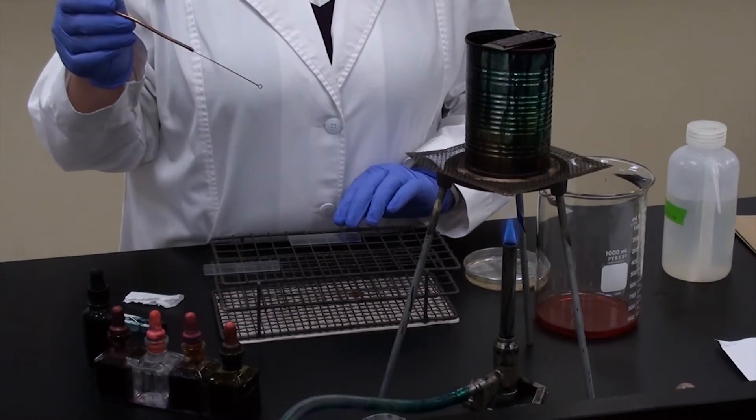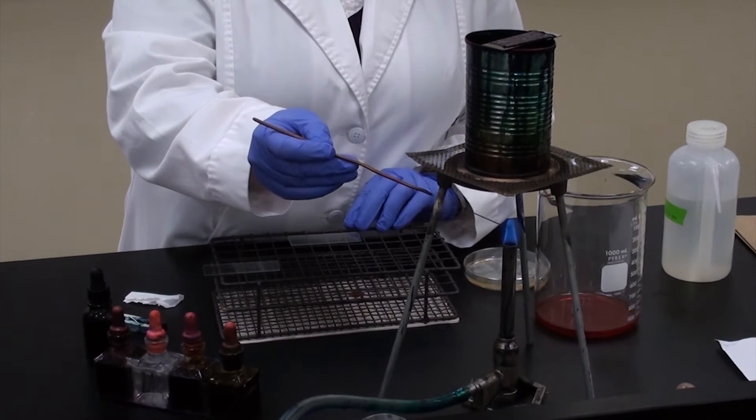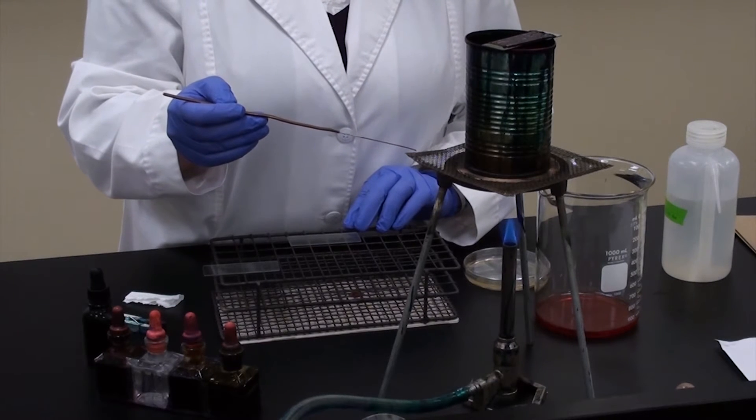The first part of completing an endospore stain is just like doing a simple stain. First, we're going to heat fix bacteria to the slide. If you remember correctly, I'm going to heat my loop and let it cool for a short amount of time.